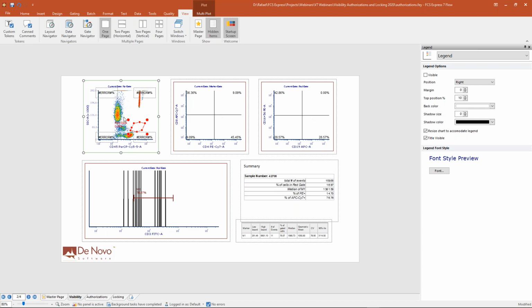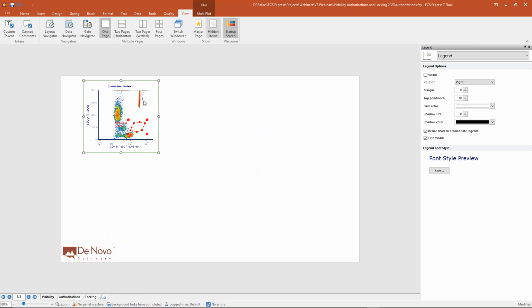And without quadrants, there's no statistic to evaluate. So we just default to showing error. And also when you don't have quadrants, we typically hide these text boxes. So if you see them, don't worry about it. It's completely normal. But if I go ahead and uncheck the hidden items box, you'll see that they disappear back to their normal state without quadrants. They're normally hidden from your view.